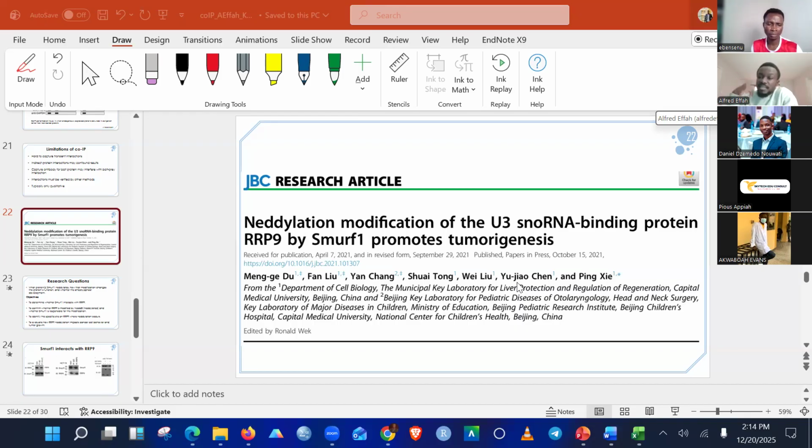So we harvest the liver, isolate the cells, and perform all the analysis, going through the whole steps as I mentioned. No matter what, it will still come out of the system.